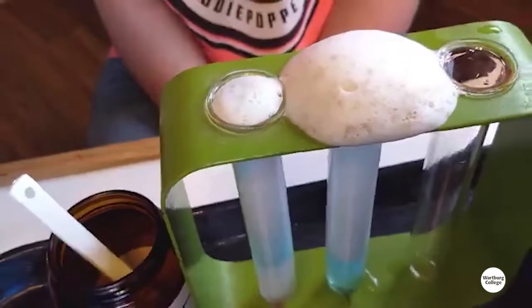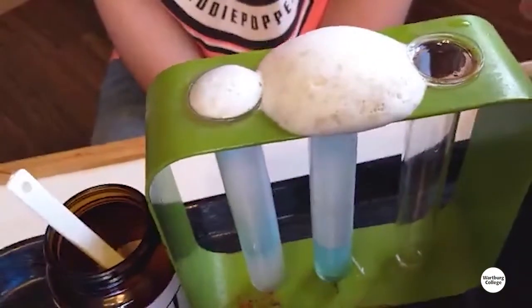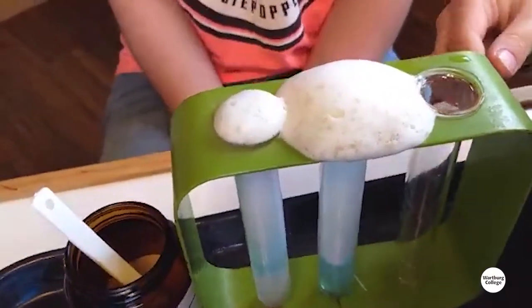So in this case, we're using yeast as the catalyst to help with that hydrogen peroxide decomposing to give us water and oxygen. Can I mix through the middle? You do what you want — it's your experiment.